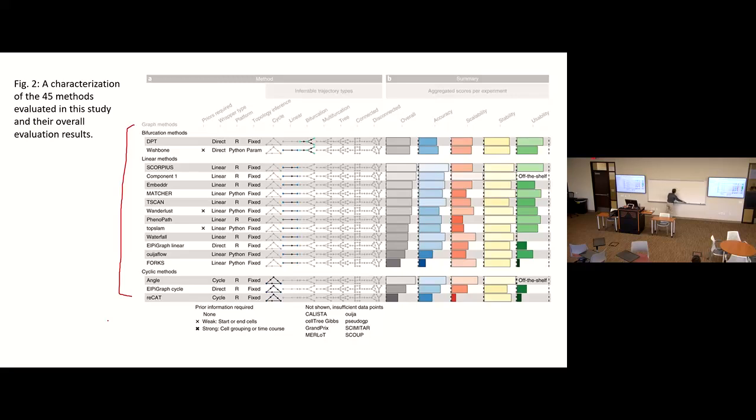So this algorithm allows you to keep the relative distance between cells, not lose the relative position globally. But with t-SNE and UMAP, you lose the real distance information globally. You just try to generate isolated population clusters.